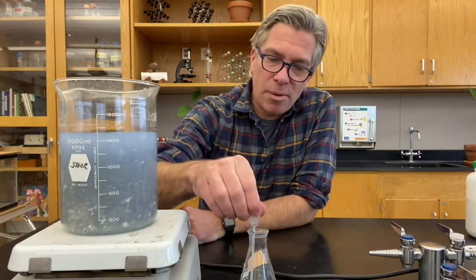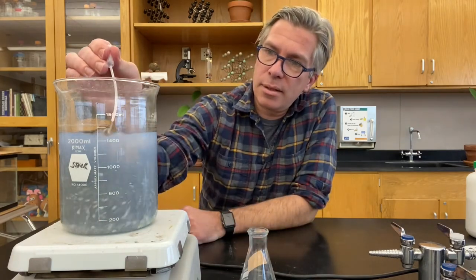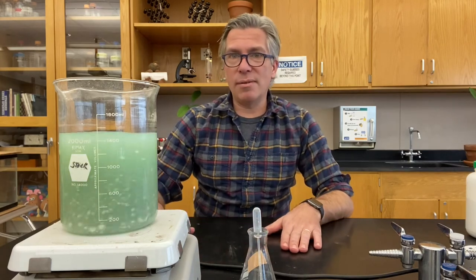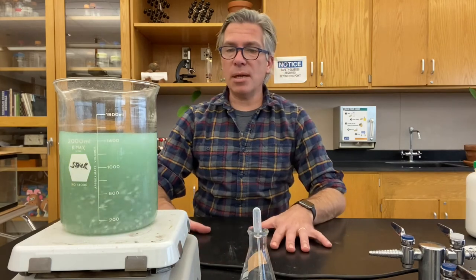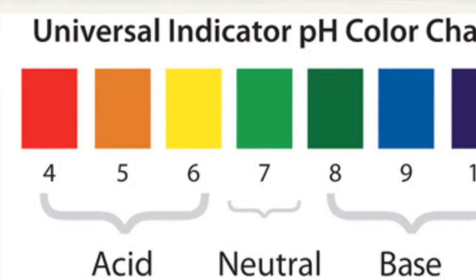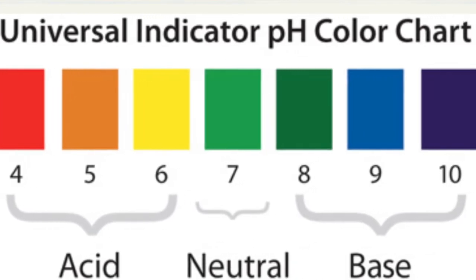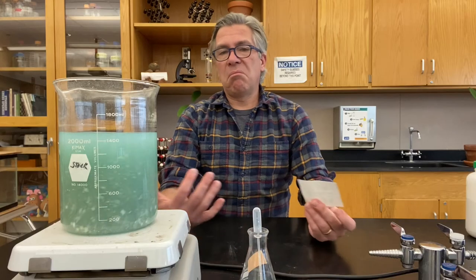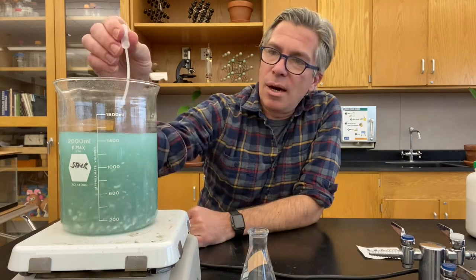So we're almost back to our purple color. Let's have some fun and try it again — a little hydrochloric acid in there. Definite color change. We had the pink, now we're back to yellow already, trending toward green. Universal indicator is a mixture of indicators that has a fairly definite different color at different pHs. It's not super exact, but you can get a good idea — right now I'm at kind of a bluish-green, which corresponds to a pH of about 9. Hours of enjoyment.